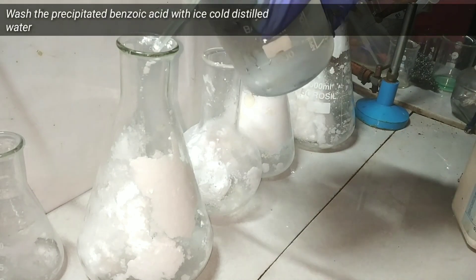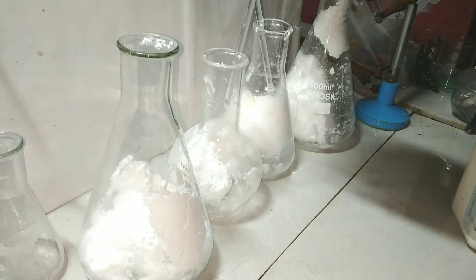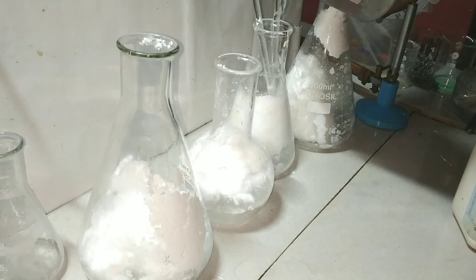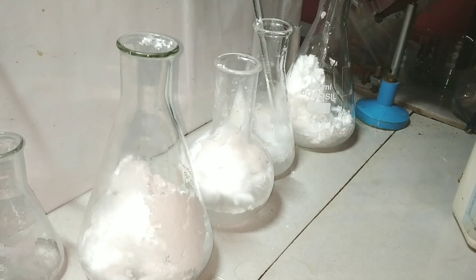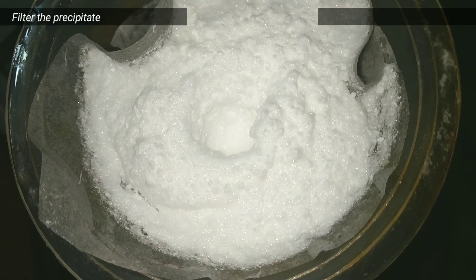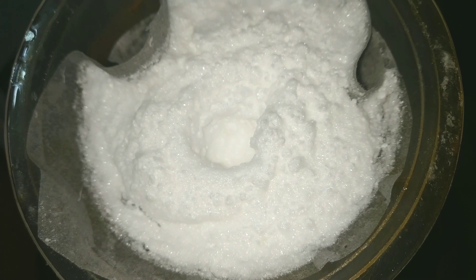The precipitated benzoic acid formed was too much in volume — my two 500 ml flasks couldn't hold it, so I had to take it in various vessels. After that I washed the precipitate a couple of times with cold distilled water. After the washing step we filtered the precipitate and again washed it a couple of times with cold distilled water.